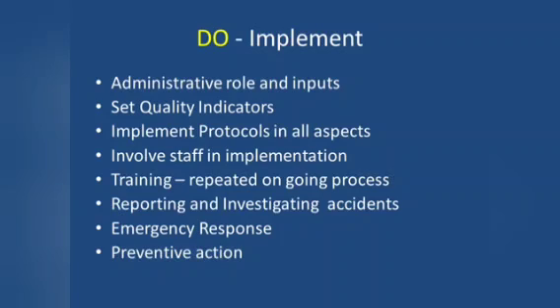Implement protocols in all aspects. Involve the staff in implementing, and the staff would include the medical, the technical, the clerical, and housekeeping.